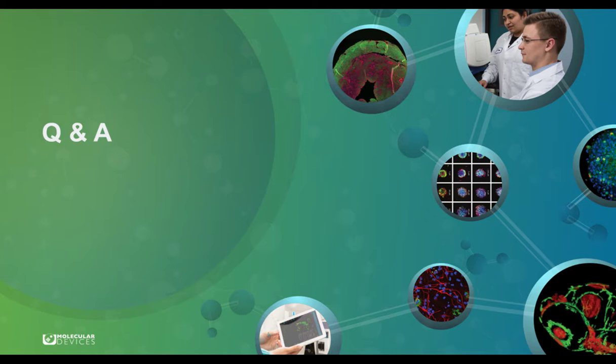Oh, that is a good question. The answer is no, we cannot do the event detection like the threshold search, template search, and single channel search, or even the population search and action potential search in the event detection. No, the answer is no.